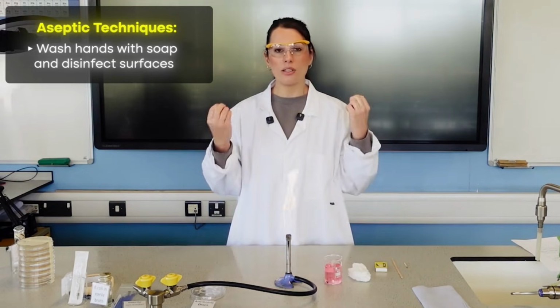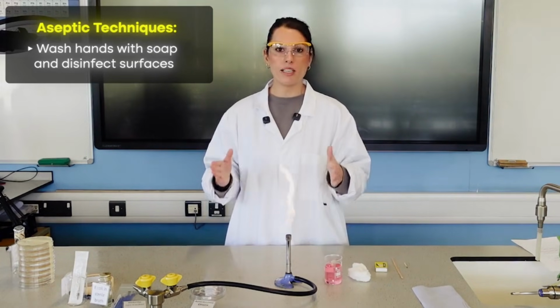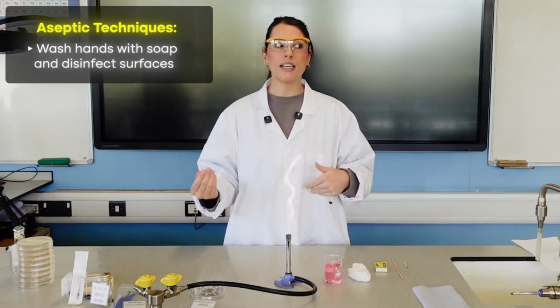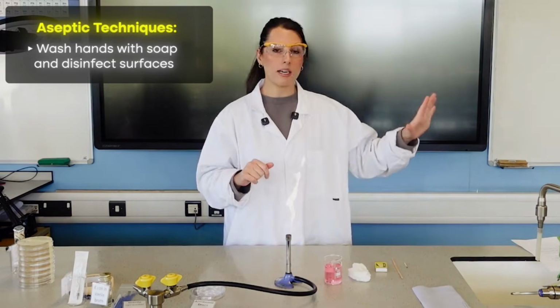The reason for those are you need the soap or the disinfectant to actually kill and remove other microbes that could contaminate your plate. And in terms of at the end, it's to kill the bacteria you've been growing so you don't then spread it across the school.